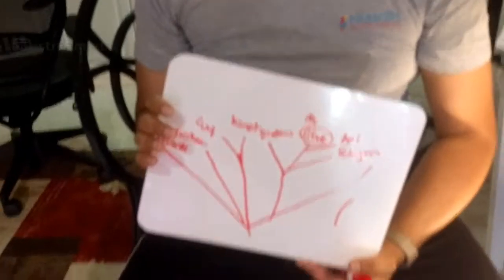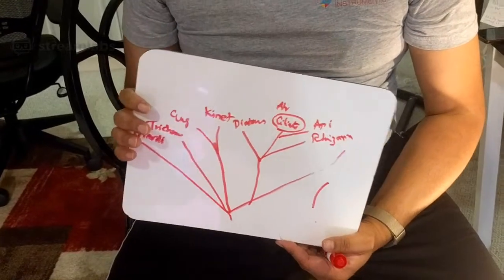So where are we? All right, so here we are. Ciliates. There are hundreds of types of ciliates, and thousands actually. I have this book, The Illustrated Guide to the Protozoa.